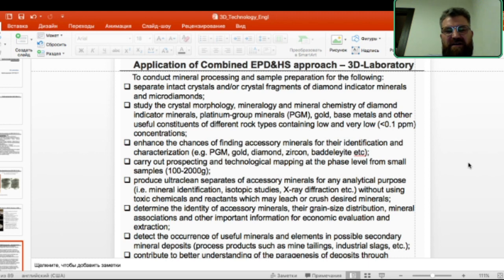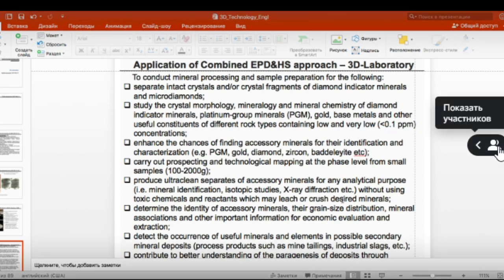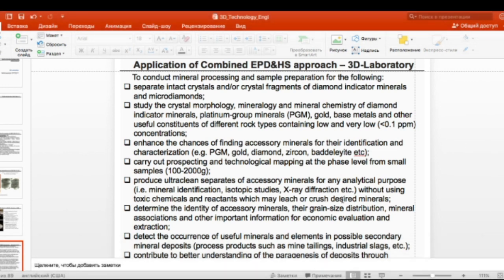So just from 3 samples, we found gold nuggets, very small grains. So quick, having just the concentrates and then picking particles from HS concentrates, which are very small. You know, the till sample can be hundreds of grams, and then you just separate particles, and then it's easy to hand pick them from the concentrate.